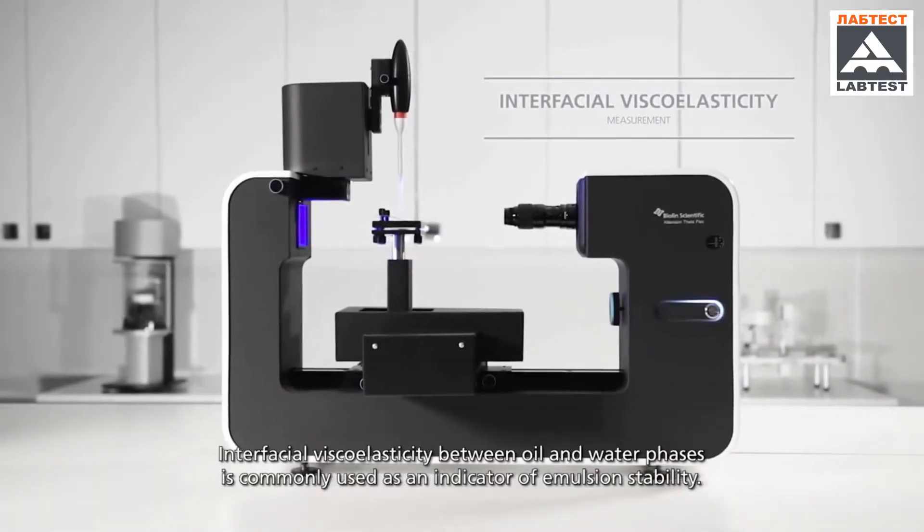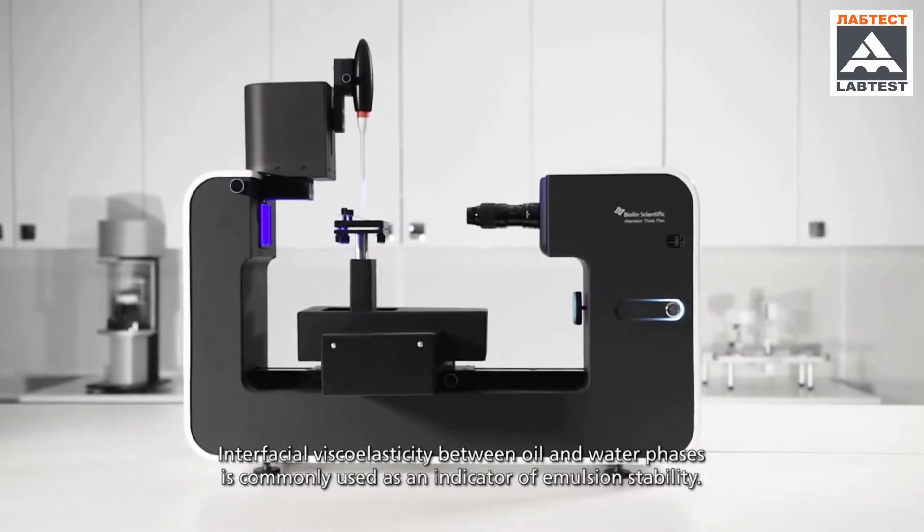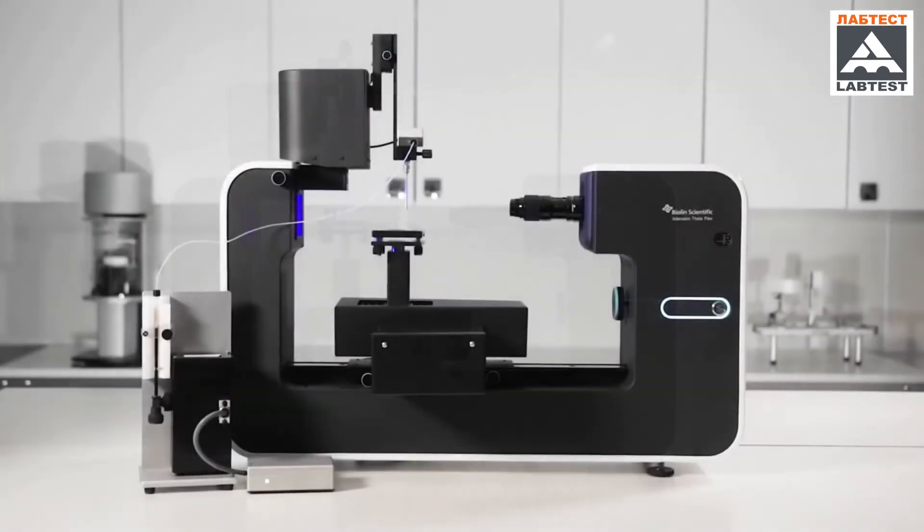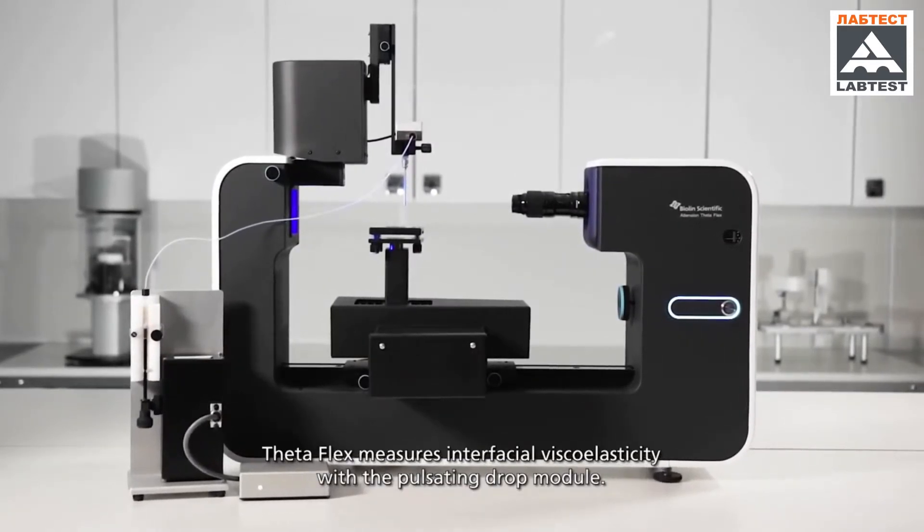Interfacial viscoelasticity between oil and water phases is commonly used as an indicator of emulsion stability. TitoFlex measures interfacial viscoelasticity with the pulsating drop module.